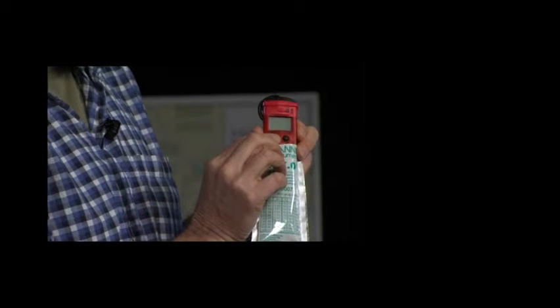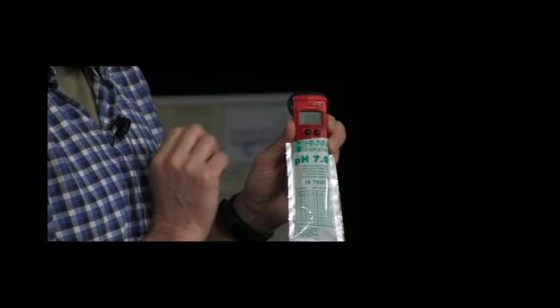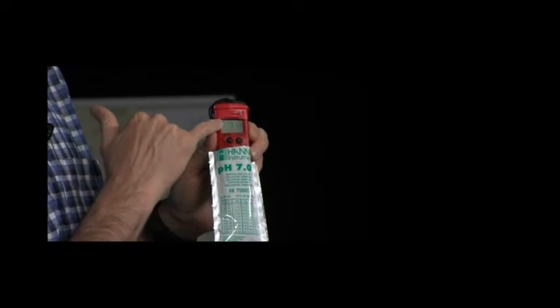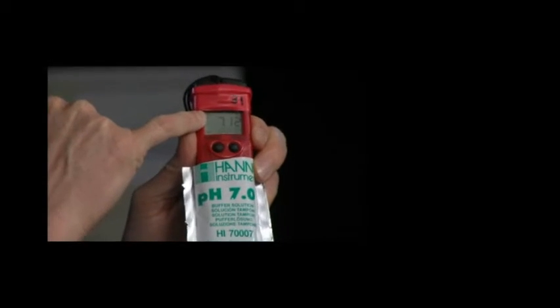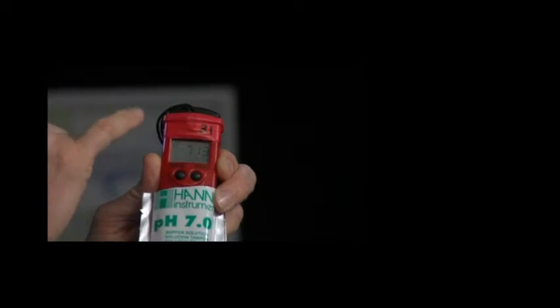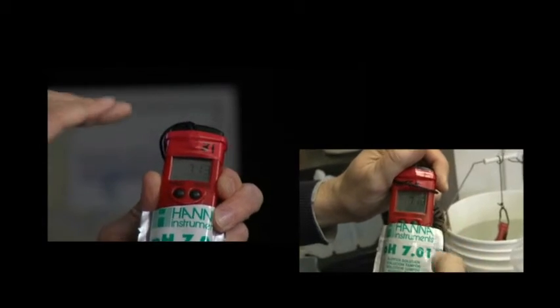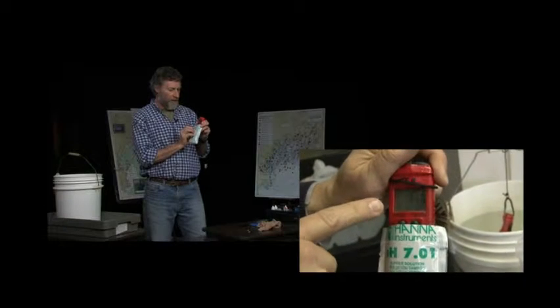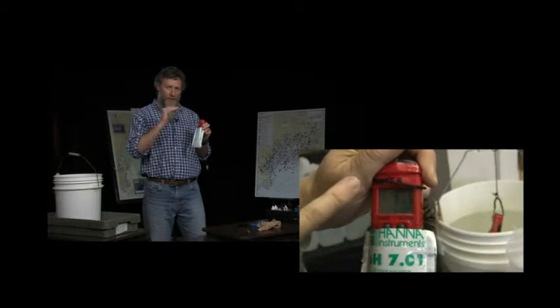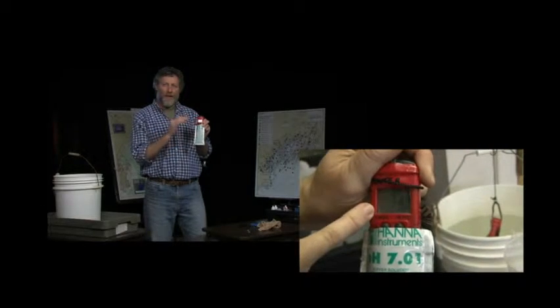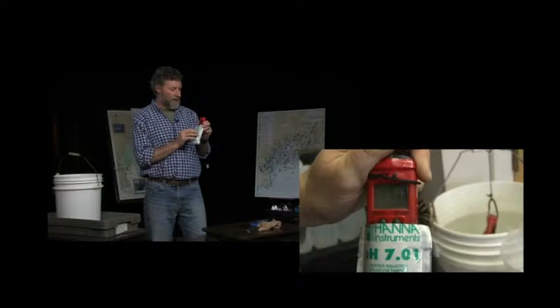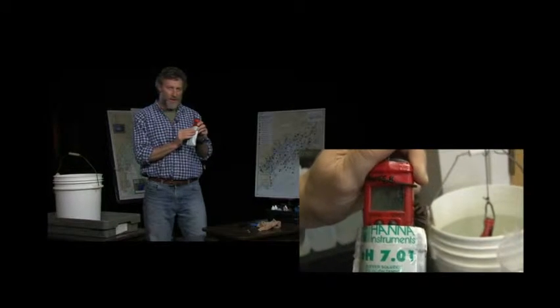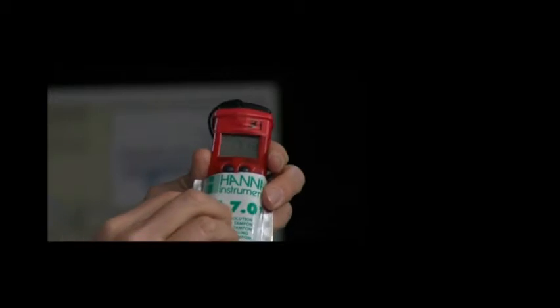We'll push the little black button on and it will read battery first. Typically it's around 100%. These are new pH meters that have new batteries. It's something we'll also want to keep an eye on. If the battery percentage goes down lower than 60%, then we know that it's time to change the batteries.